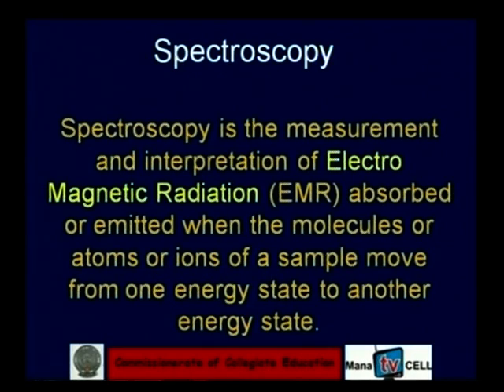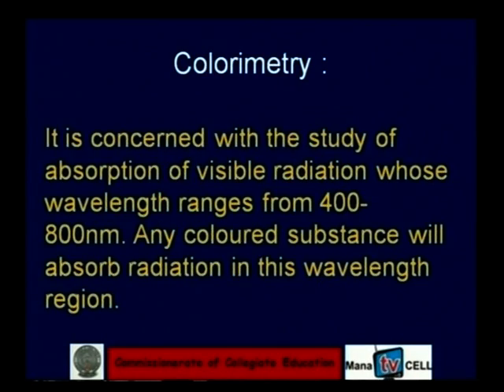The next principle is that every substance has a capacity to absorb or emit certain wavelengths of radiant energy. This absorption and transmission of certain wavelengths of radiant energy is characteristic for every substance. For example, chlorophyll absorbs only red and violet light, while it transmits only green, blue and yellow wavelengths. This absorption is the characteristic of every substance.